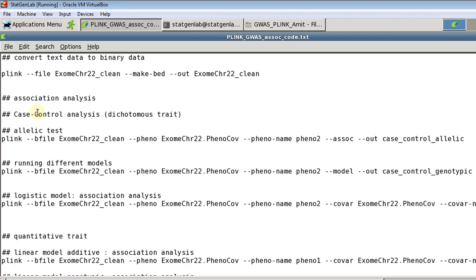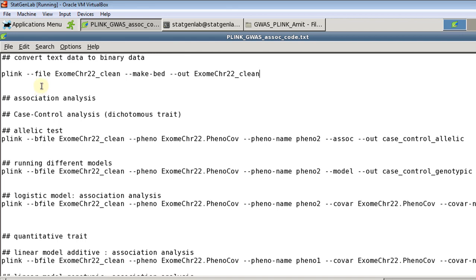So the first part would be we will be using dichotomous outcome. So for that we have various options in Plink. We can perform allelic test. So to perform allelic test first we need to call our data set. Before that, just like I showed you in previous video, I am going to convert our ped and map file into Plink's binary format. The reason is that it compresses file which is easier to read, quicker to read, and then it's much faster in doing analysis.